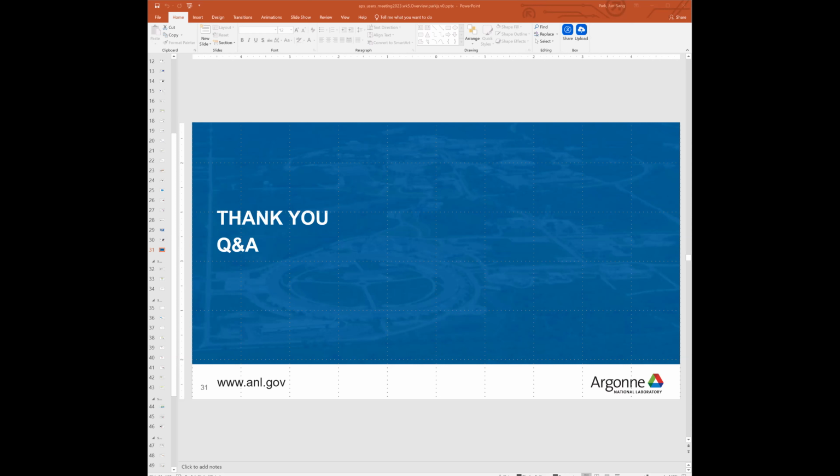Thanks, Mike. And June, great talk. It was good to see the current plan of the upcoming beamline. It was exciting. I have two simple hardware questions, I suppose. Is there a current choice for a far field HEDM detector? Is it a GE or potentially something with a higher dynamic range?